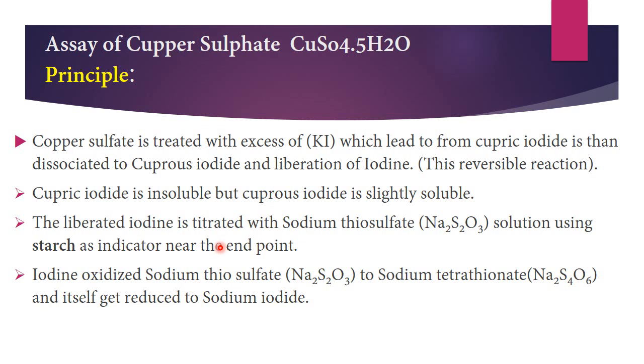بين لأنه عندي هنا الأيودين is not free iodine وإنما هو liberated or produced by the reaction of analyte with potassium iodide.